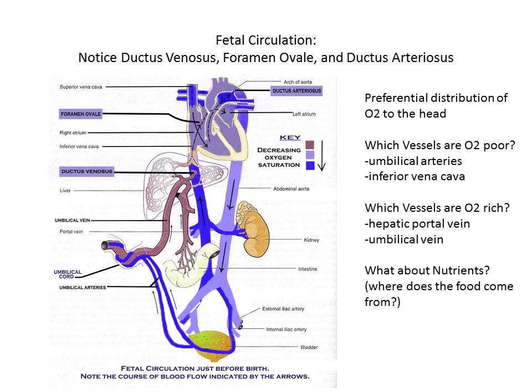It's not because of the tryptophan in your turkey, it's because you got too much blood flow in other places. From the intestines, it goes up through the portal system into the liver, where we have the first steps in storing that energy, storing it as glycogen and so forth. So normally this is a really rich source of nutrients in a fully functioning critter.